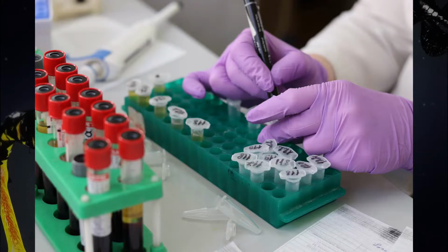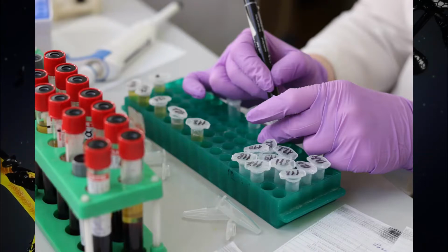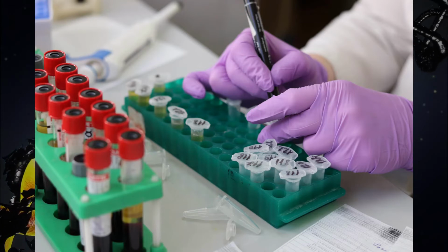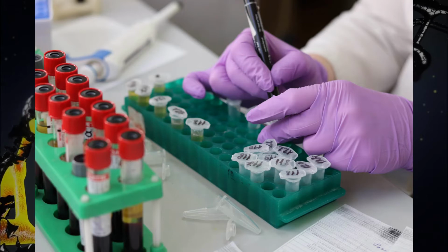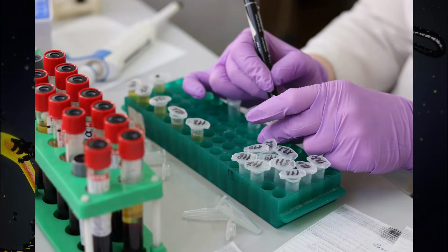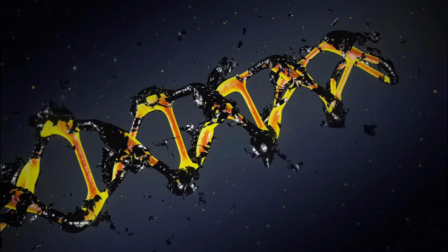You then need some sort of probe. The probe is what lets you know that the DNA is being replicated. If you were just trying to measure the amount of DNA in solution, you could use something like a nanodrop. That would use an amount of light shone into the sample, and the amount reflected back would give you an idea, but that's also prone to becoming contaminated.